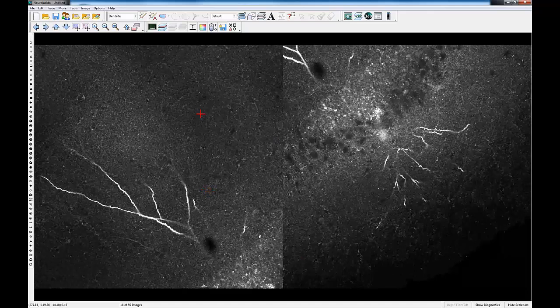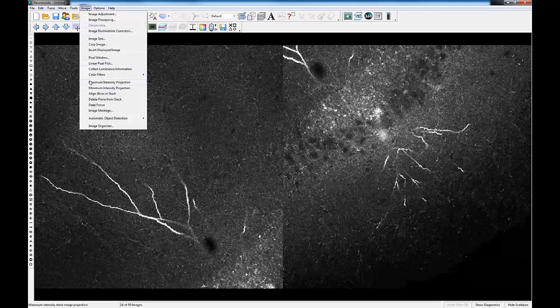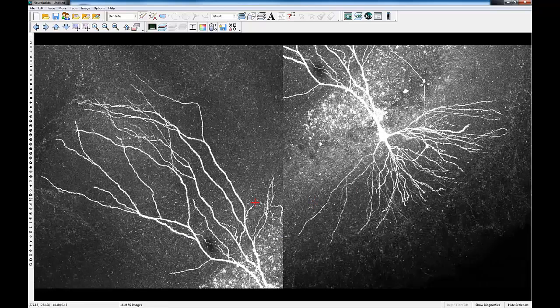But now with Neurolucida 360, we're going to take it out of this XY-centric view and allow you to collect all your data in this 3D interactive environment. First, however, we have to stitch this montage together. So you can kind of see here, there's this hole in the tissue here. These two guys, that's where they overlap. So let's take a look at that.